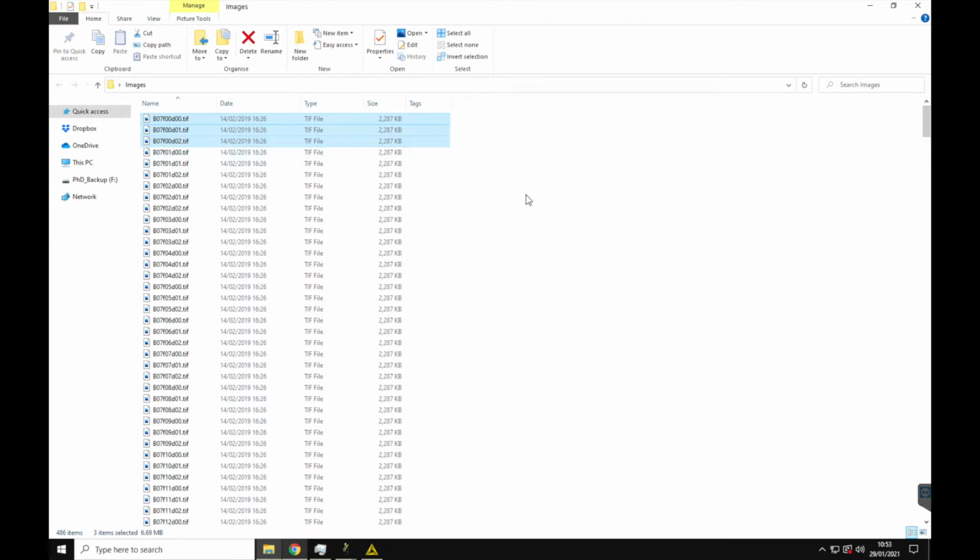Now this is an all-in-one workflow for which to run you basically just need images of infected host cells stained for the protein of interest for which you want to train the model, and you will also need a good computer with a GPU that is able to run GPU accelerated calculations for training of the neural networks. Best to have a GPU with as much VRAM as possible. I'm using a NVIDIA GTX 1070 with 8 GB of VRAM, could be better though.